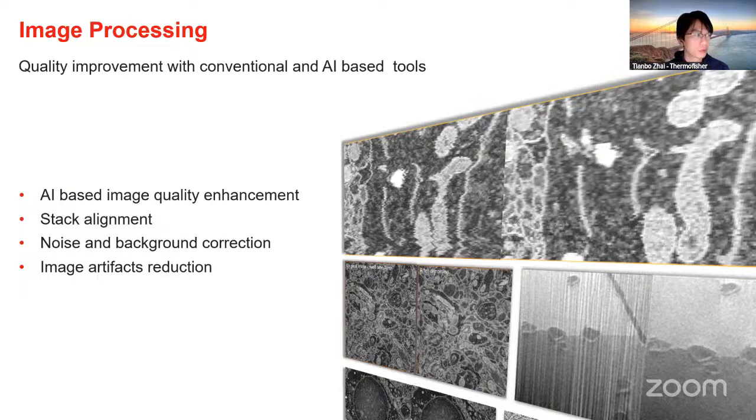And also, sometimes, probably not as frequently, you do notice that the images you acquired are misaligned, meaning slice to slice you see a big discontinuity. You don't see the structure transition as smoothly as you would expect. So there's a possibility that misalignment is happening there. Being able to align the slices is also one of those important pre-processing steps.